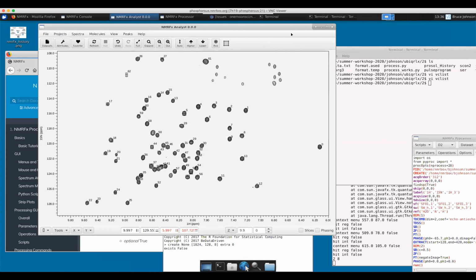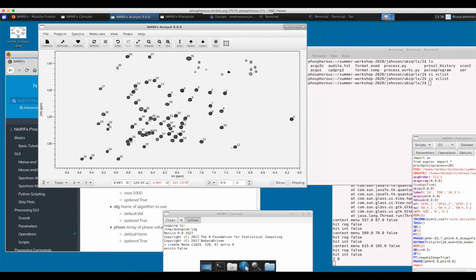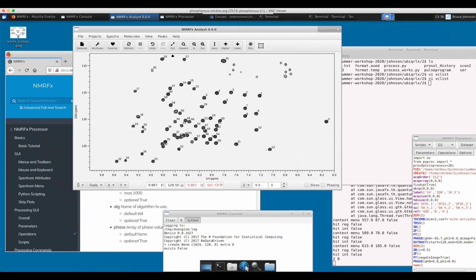And I think that is a good place to move on to Ring, because we don't have a huge amount of time left. So any questions on that? Although it took a while to display that, the basic process you can do very quickly. Open an FID, generate or open a process file, click process, pull in a peak list, say measure, if you need to fine tune it.